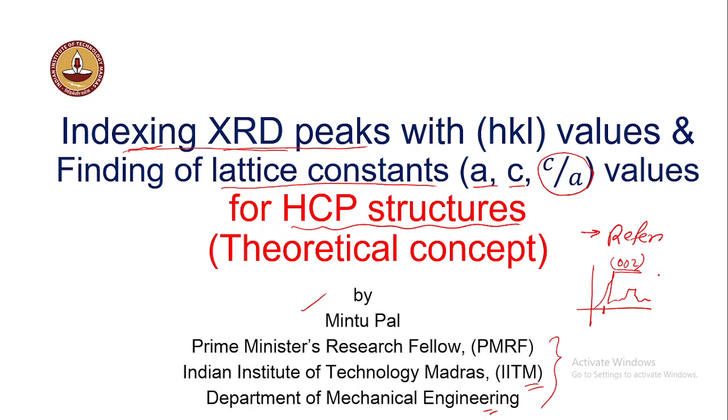The other way is that you can take help of any XRD data analysis software, and in that software itself you can do this. But the concept of how this is coming will not be clear to you if you follow the first or the second process. So in this video I will explain how you can clear your concept, the logic behind this topic. So now let's go to this topic.